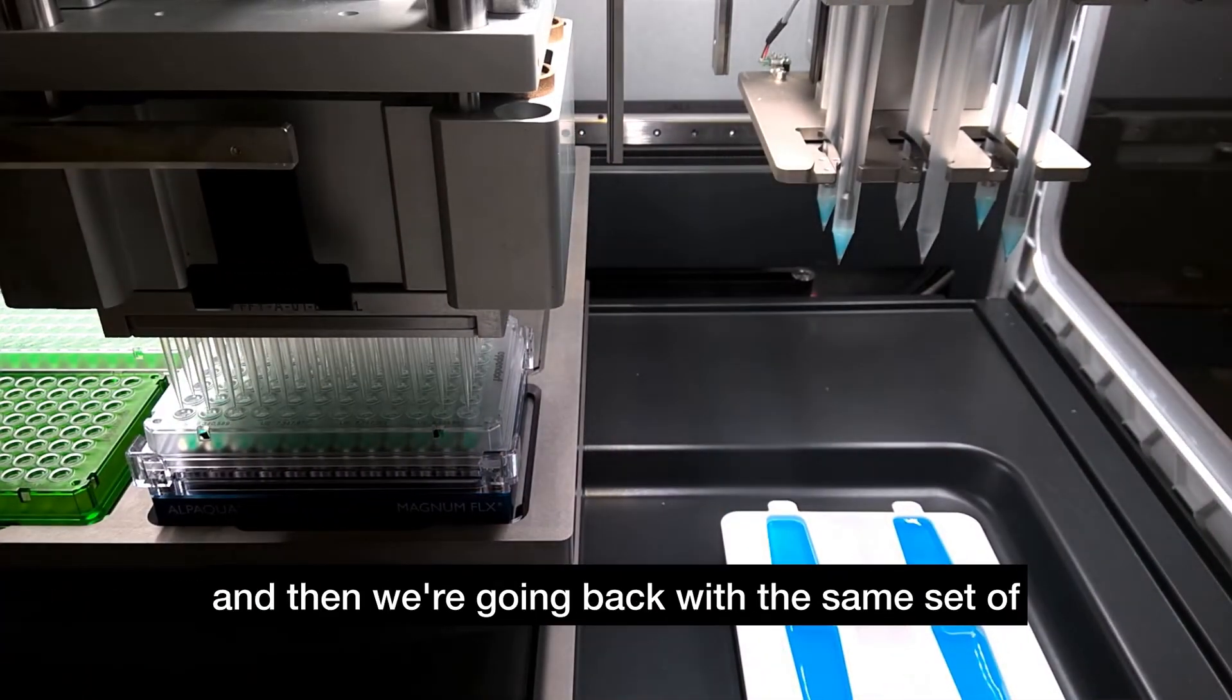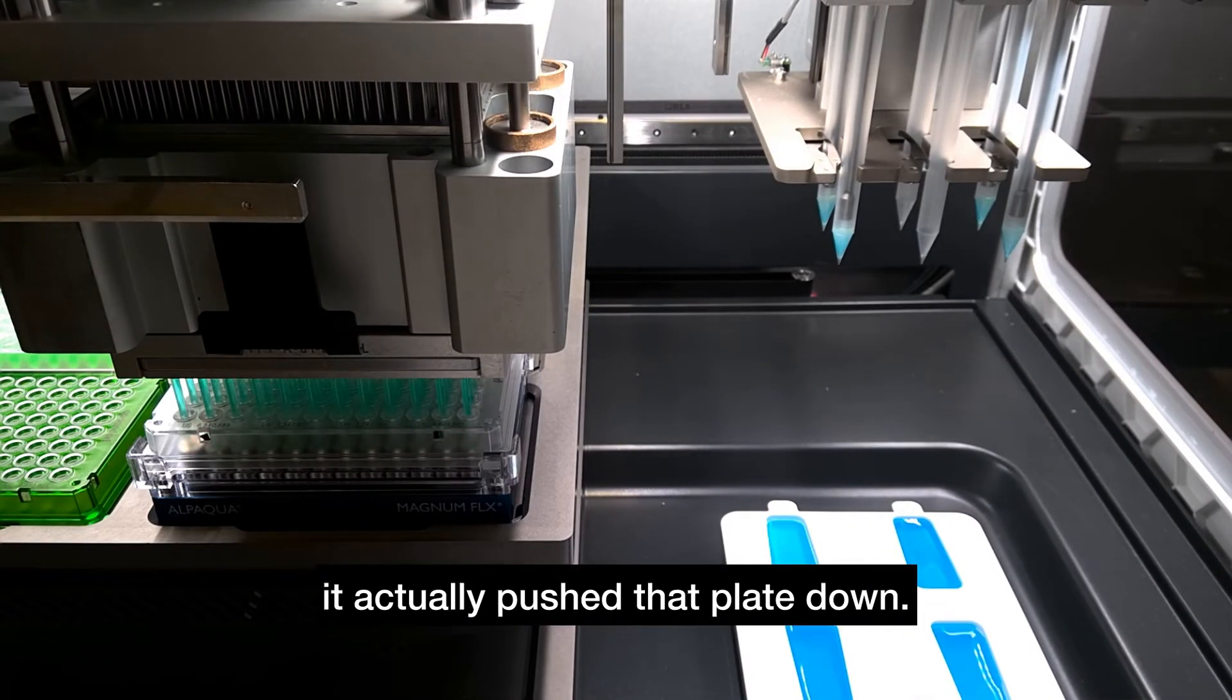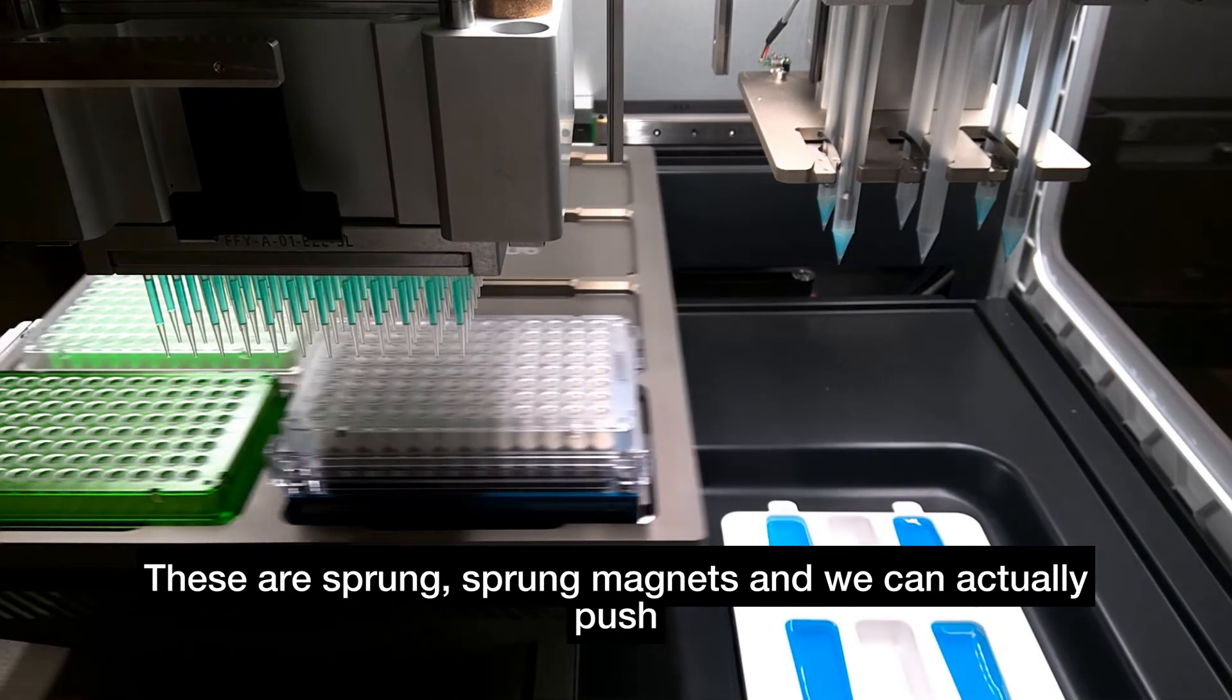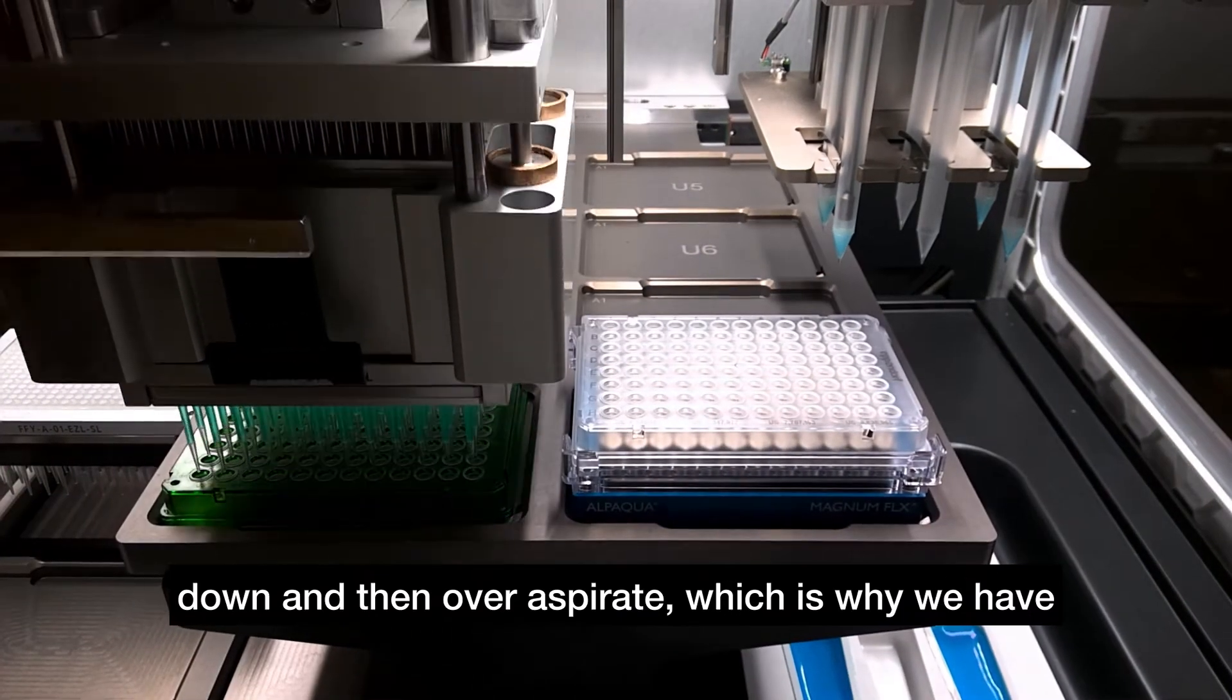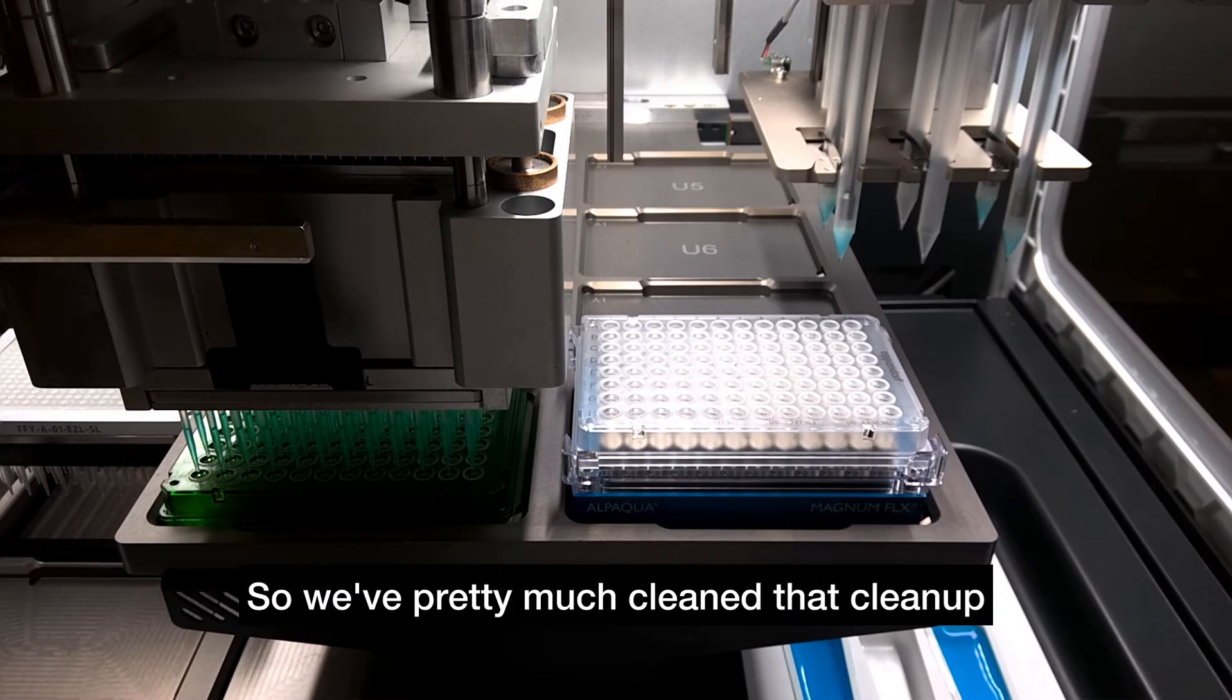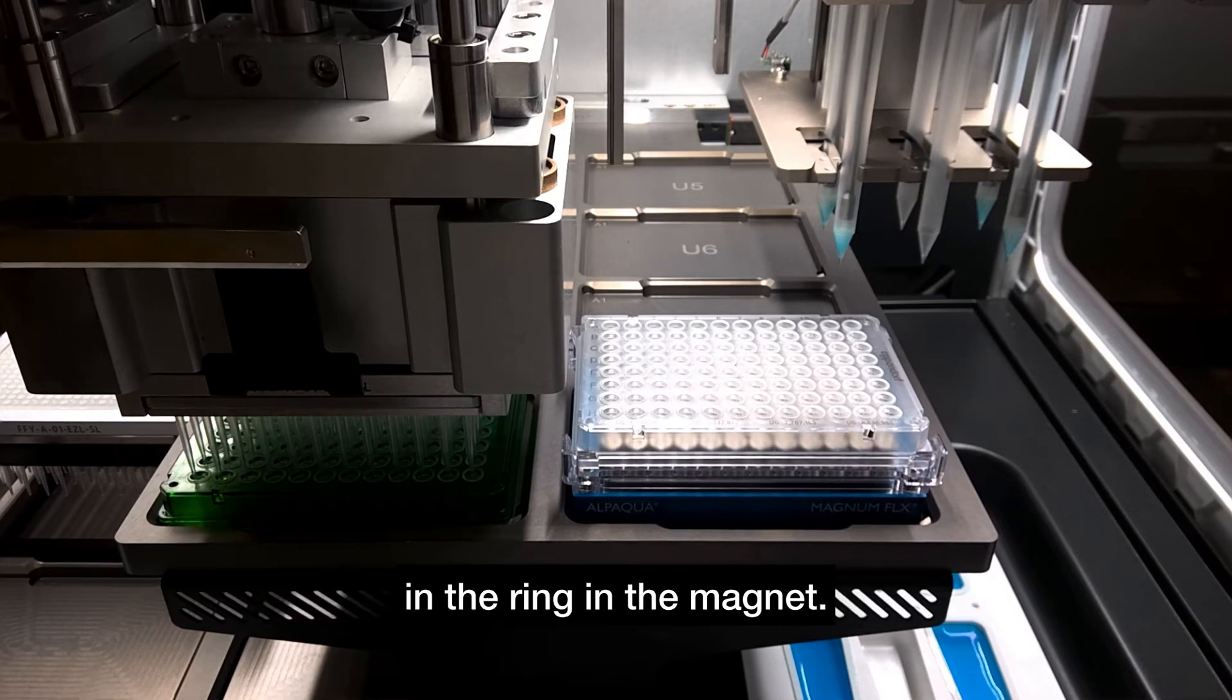And then we're going back with the same set of tips that we used for the initial transfer. And here you may notice that it actually pushed that plate down. These are sprung magnets and we can actually push down and then over aspirate, which is why we have that big air gap at the bottom of the tips. So we've pretty much cleaned that cleanup plate out and only left the magnetic beads in the ring in the magnet.